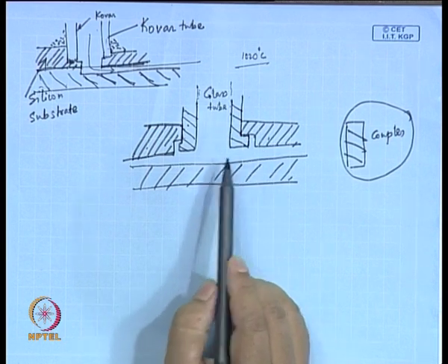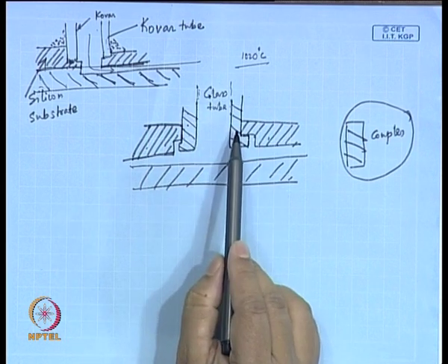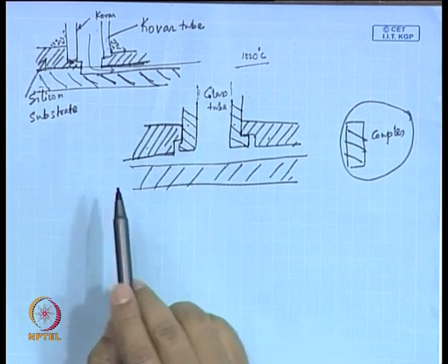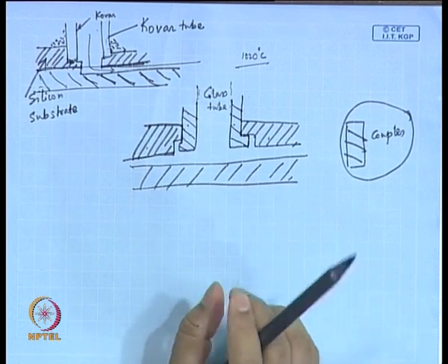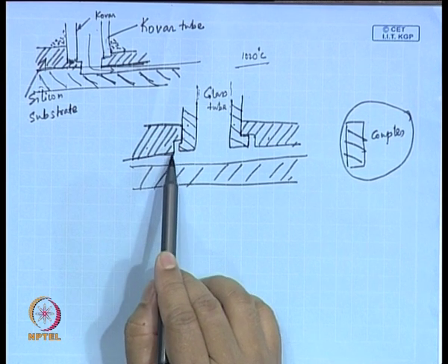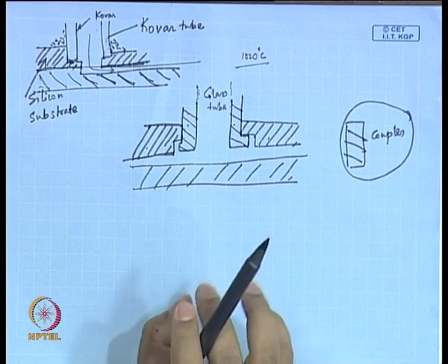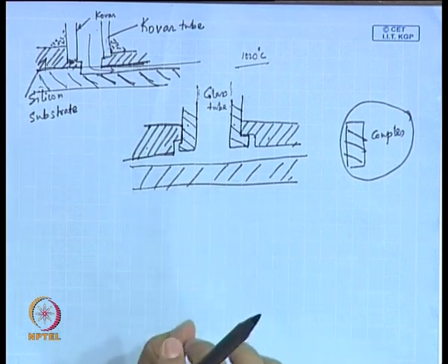Now, the idea here is that this coupler material, you apply some heat. This coupler material is made of plastic. This plastic material melts, may not be perfectly melt and leaking from everywhere, it just gets softened, it melts to some extent, and this plastic material flows through various gaps, the places where the leakage can take place, and it will make a permanent sealing.